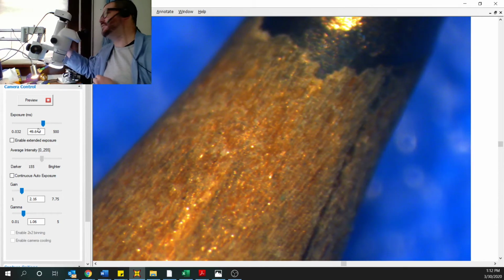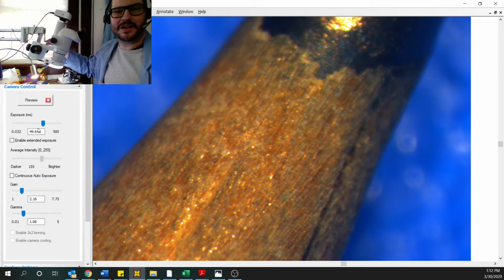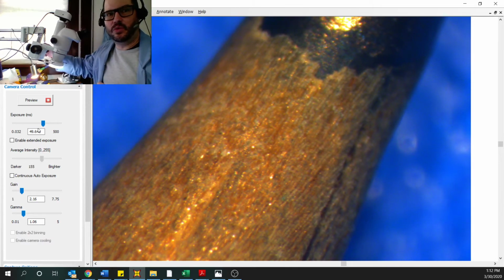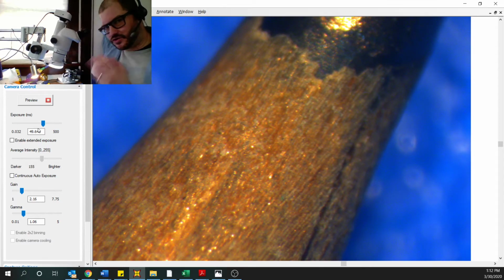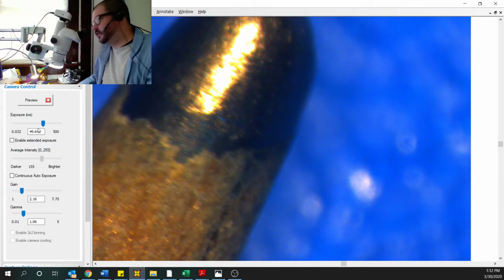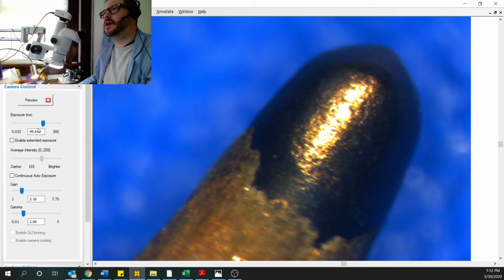Ooh, that's at 40x magnification, and you can really see the little pieces of wood that make up the pencil that we sharpen away to get to a nice fine point. And look at the part that we actually write with on there.